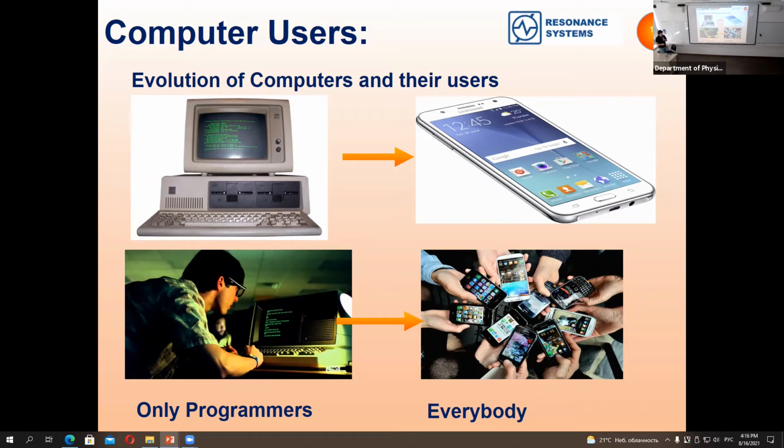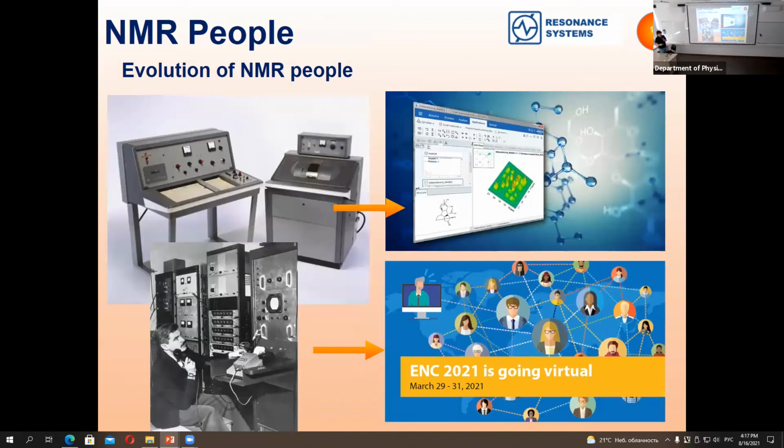Now things changed, possibilities are growing, and now every one of you has a computer, and everybody is using a computer. So this is the trend of common progress. The same is happening to NMR. All the devices, you had to be a chemist, you had to have knowledge in electronics, in programming, in lots of things, and also in magnetic resonance to operate it.